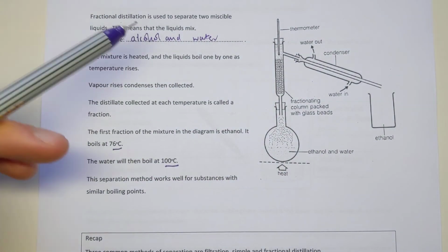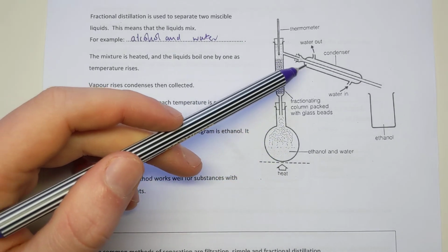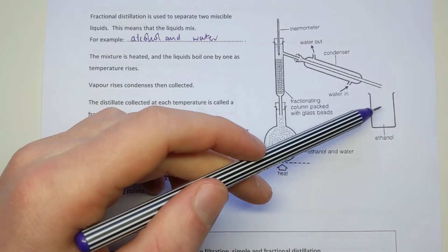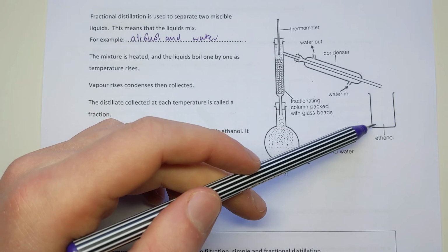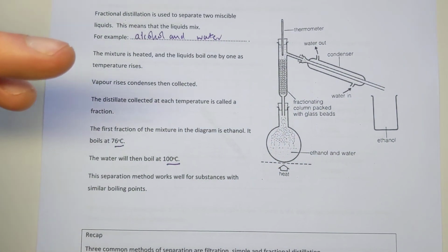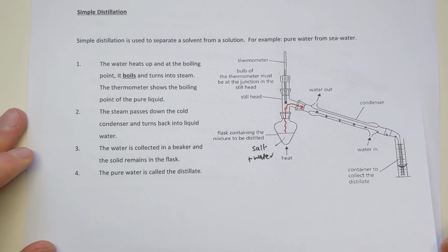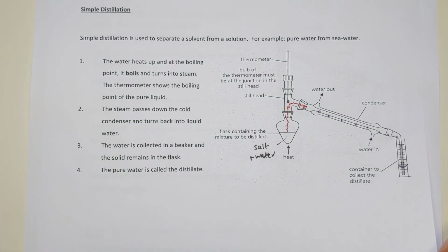After a little bit longer heating, then I should be able to get my water to evaporate, go through the apparatus, condense, and turn back into a liquid. I probably would switch the beakers over once I thought I got all the ethanol in and get a new beaker full of water. You might therefore be thinking, well, hold on, that is just exactly the same as distillation we looked at before. That involved heating something up, going through the condenser and collecting it. It is pretty much the same.